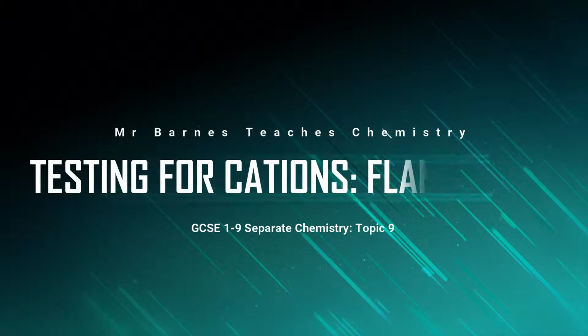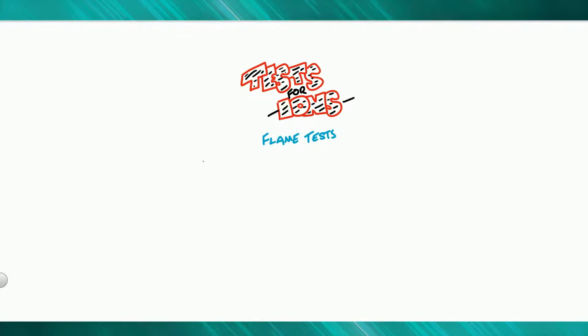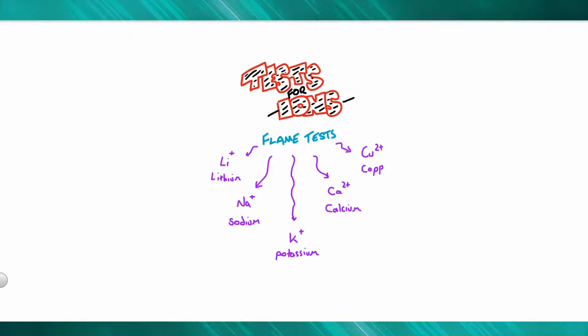Hi guys, welcome to this video looking at how you can use flame tests to test for different cations. There are 5 different cations that when you put them into a Bunsen burner flame give different colours. You need to know the colours given out for each of those different cations. The cations in particular are lithium Li+, sodium Na+, potassium K+, calcium Ca2+, and copper Cu2+.